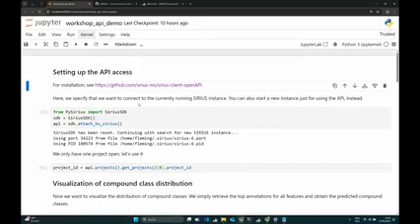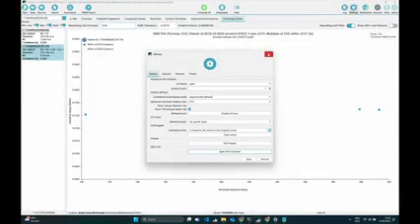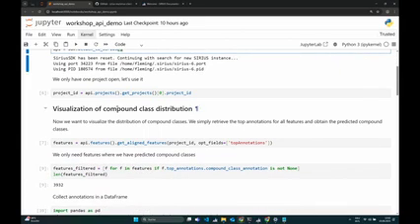And what we will now just do is attach to the running SIRIUS instance. And this is just the first block. So whatever we have started now, the project that we have just opened, will now be available in Python. If we execute this code, so we just import PySirius and then just attach to SIRIUS.